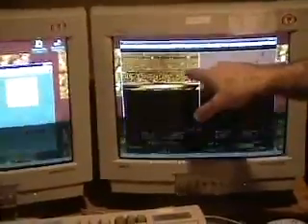And so if we look on the image, let me change it back to 256. The image kind of looks stretched out because we're not actually moving in this direction, even though it's displaying it as if it were. So we're just scanning back and forth over the same features, and some people prefer this mode for adjusting the feedback parameters, but I don't. So I always leave that enabled.